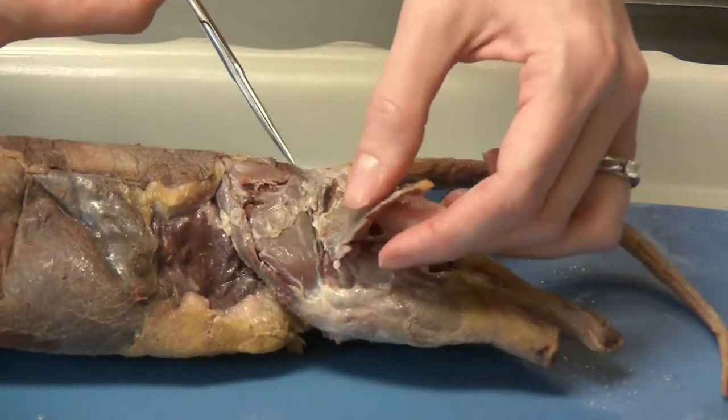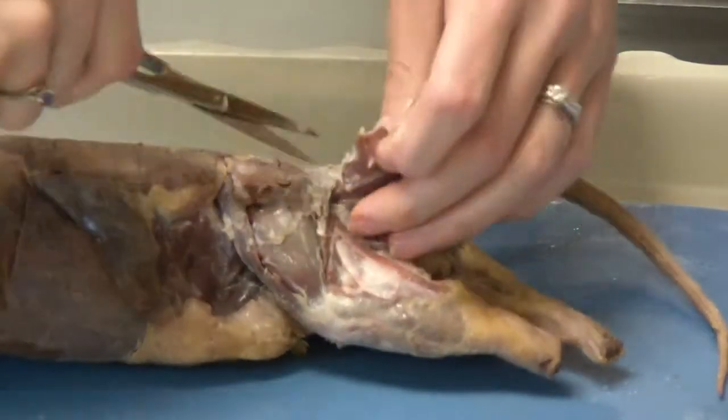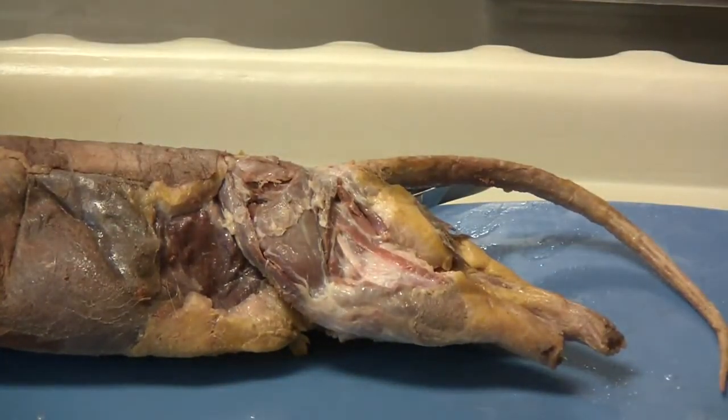We are not cutting the caudofemoralis either. We are making sure that we are just getting the biceps femoris, and we can discard that piece.